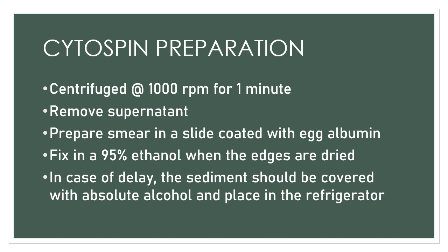Okay, and so in case of delay in fixing or preparing the sample, then the sediment should be covered with absolute alcohol and placed in the refrigerator, at ref temp.